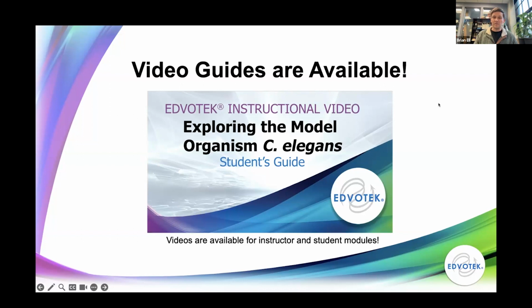And Stephanie created a really nice video that goes through how to look at these, how to monitor thrashes, and then gives you an example of how many thrashes you would expect to see in a given amount of time. Really, really great resources, and I highly recommend everybody checking those out.